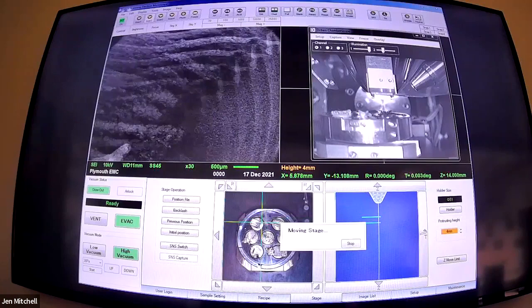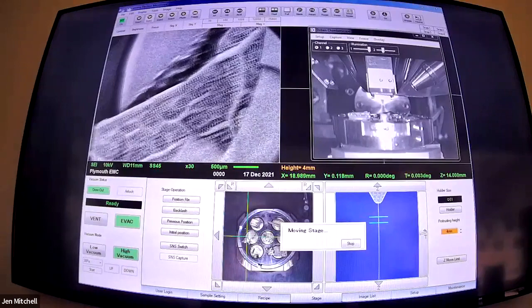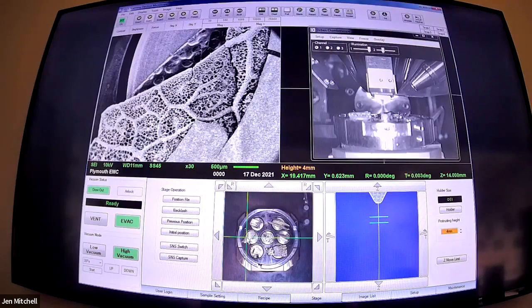Today we're using secondary electrons, so what we're doing is looking at the surface of samples. It gives you a really good sense of topography. Feel free to have a guess - it is plant, but if you've got a particular sort of festive plant you think it could be, we'll see. I will try and get something in focus.